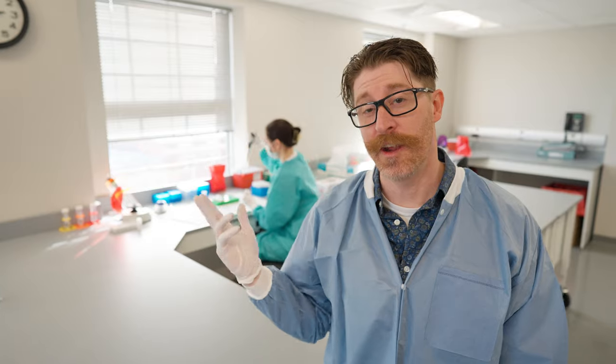The first step in this process is extraction. This is where we are going to clean the sample as well as get DNA into solution or what we call the lysate. Here we have an analyst adding reagents in the first step of the extraction process.